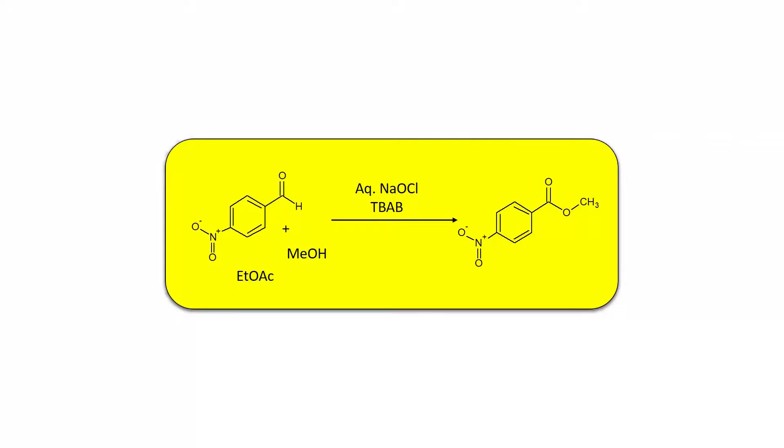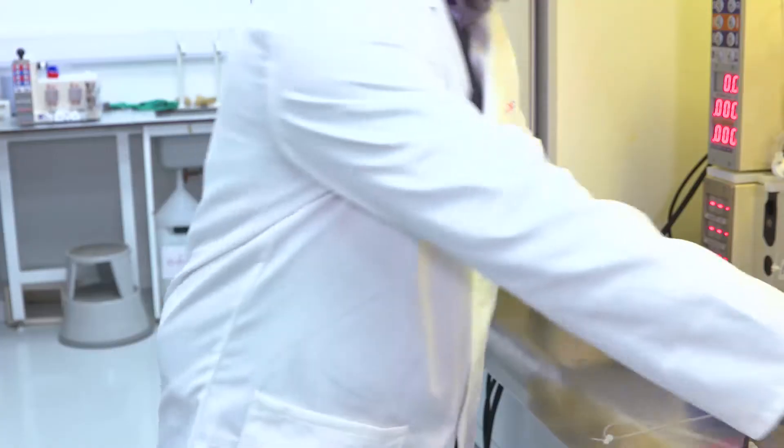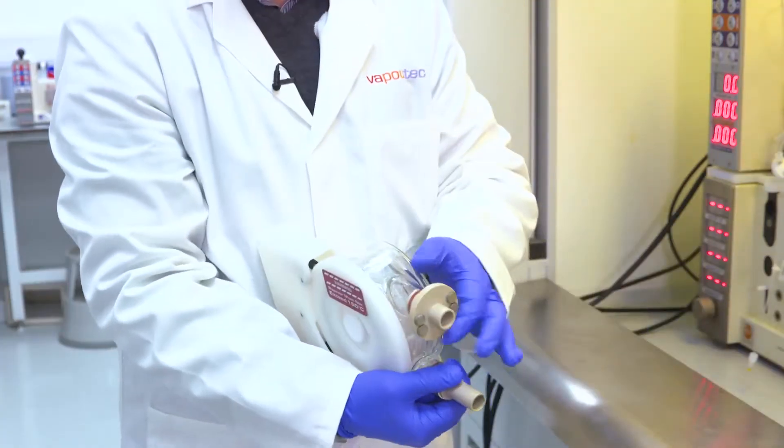This is a biphasic reaction. My sodium hypochlorite is in an aqueous solution and my other reagents are in ethyl acetate. So I'm going to be using our reactor for rapid mixing.